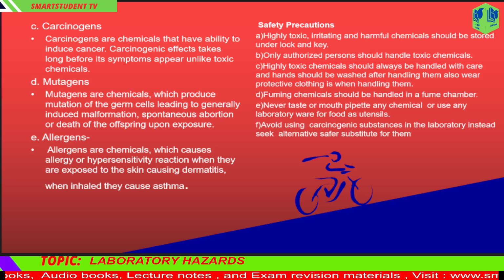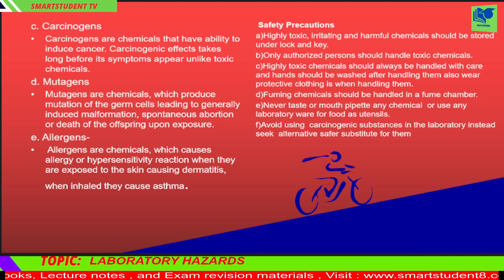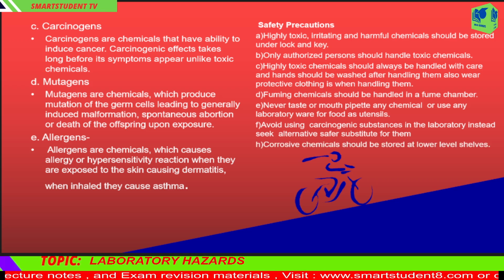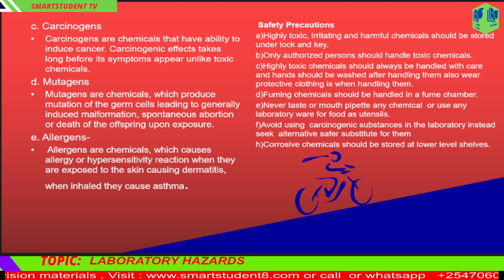F. Avoid using carcinogenic substances in the laboratory. Instead, seek alternative, safer substitutes for them. G. Young children and expectant mothers should not come closer to carcinogenic substances. H. Corrosive chemicals should be stored at lower level shelves.